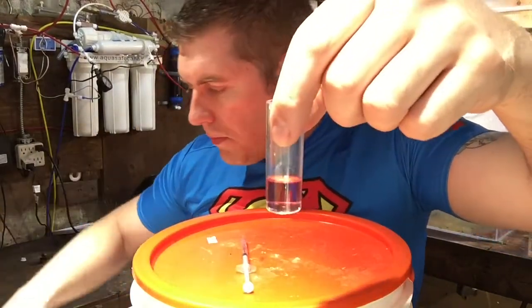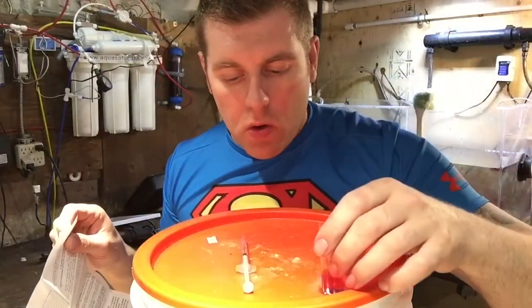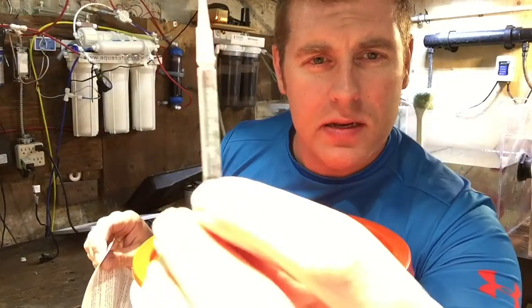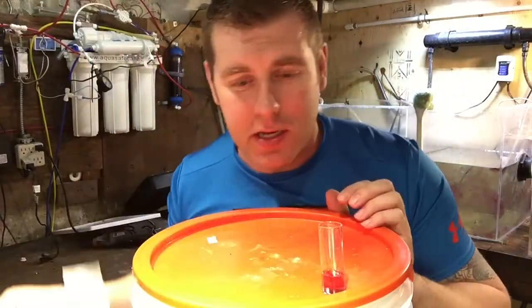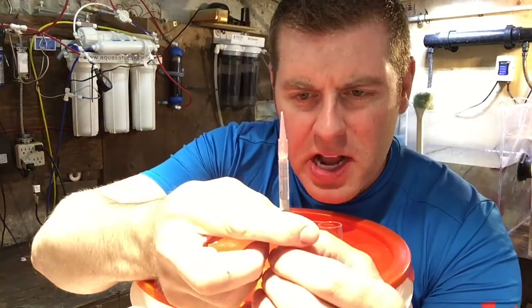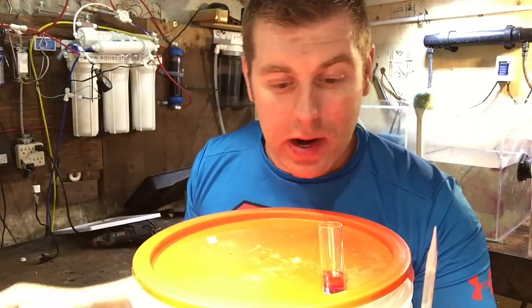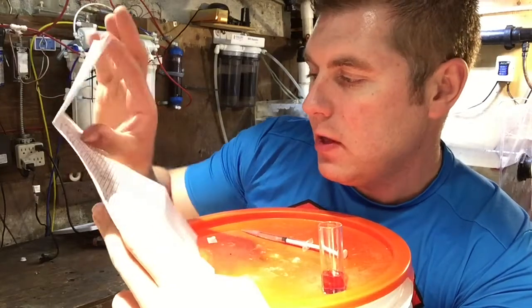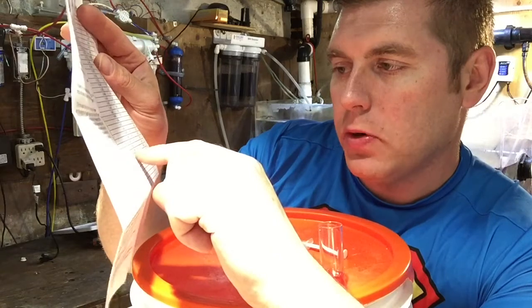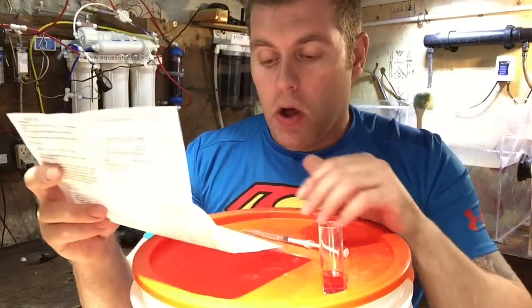Hold it up to white paper so you can see the color clearly — that pink to orange is what you're looking for. Now take your one milliliter syringe and read the piston position, then match it on the chart. My tank is reading 0.65, which on the chart — between 0.64 and 0.66 — equals 5.4 dKH. That's really low, because it should be at 7 to 8 dKH. So I know I'm going to have to buff my water.